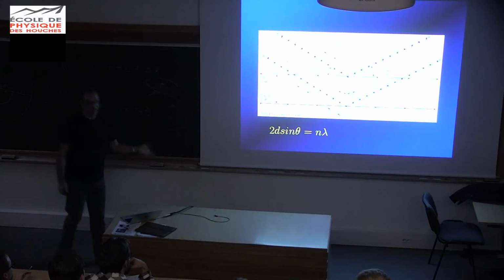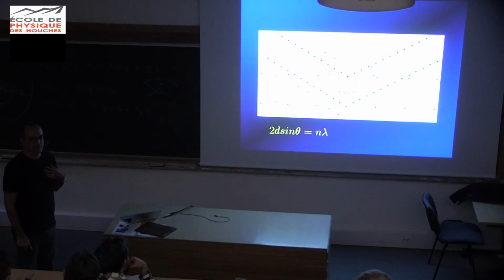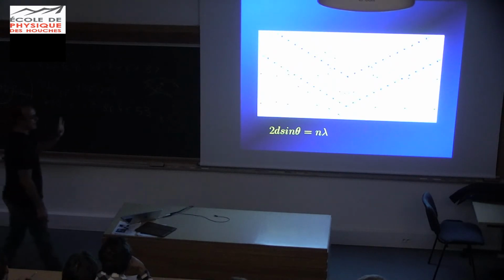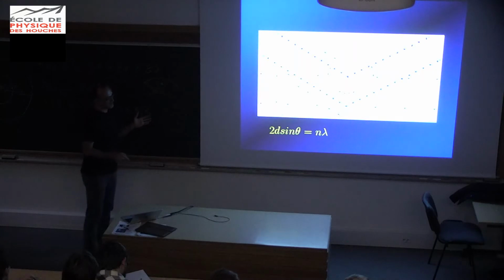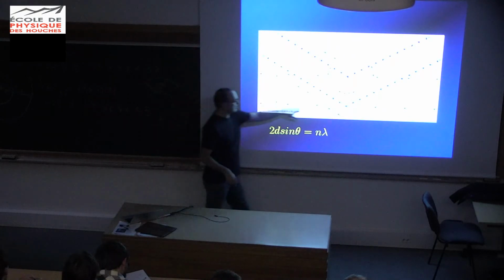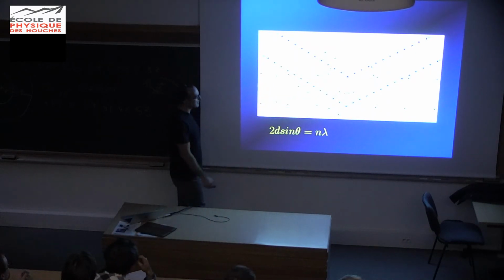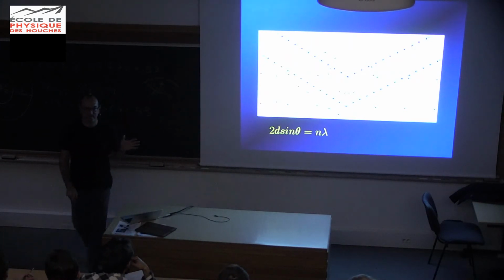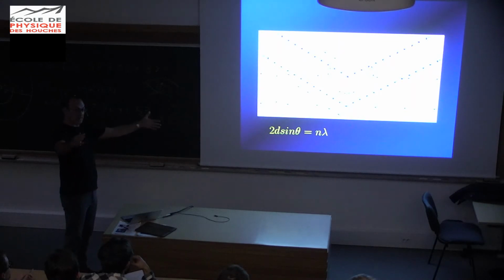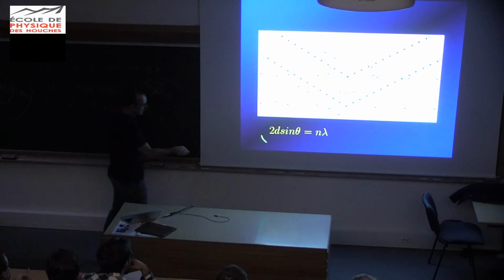All right. Of course, X-rays. The first thing you do with X-rays is X-ray diffraction. You all know X-ray diffraction. We're not going to do a crystallography course here. I'm just going to show you Bragg's law, and it basically tells you that you have a periodic network of atoms in whatever you're compressing in your diamond cell, and you send X-rays on it, and the only constructive interferences you're going to have are for certain distances, macroscopic distances, millimeters on a detector, that correspond to nanometers in your sample, which are the interatomic spacings, okay? Following this law, all right?